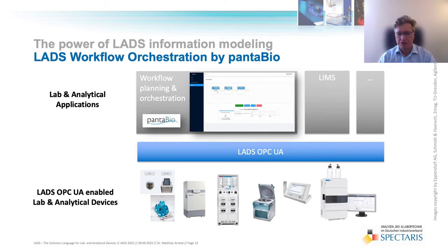Based on this information, a workflow can be planned. Once the workflow is planned, it can be executed by the workflow application. In a final step, the results of the run can be downloaded from the LADS OPC UA devices to the application software. Let's see this nice workflow application in action.